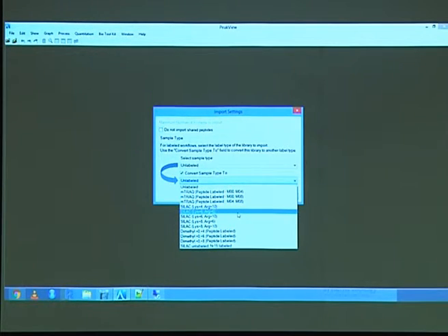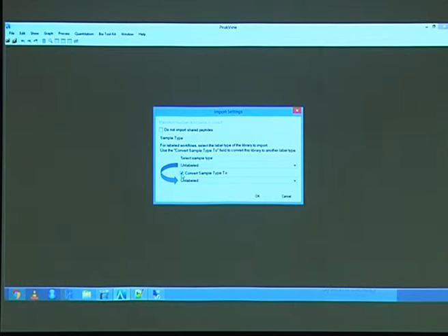The other thing, converting it to SILAC, works rather nicely. It isn't that hard, but it only generates a heavy library. It doesn't generate the heavy-light library. But we're not doing that. We don't have SILAC Mycobacterium. Okay, now it loads, and this is just the assay library, so you might get a hand on how long it might take if you load other things.